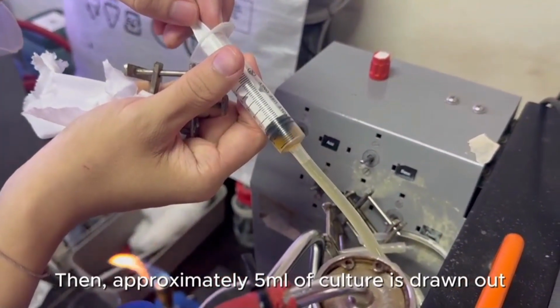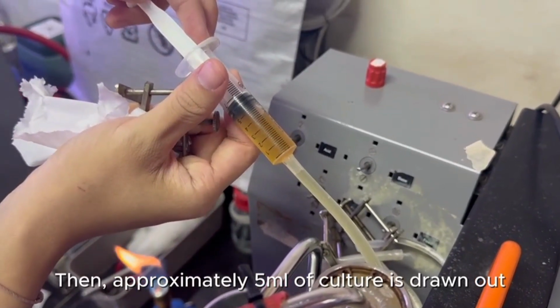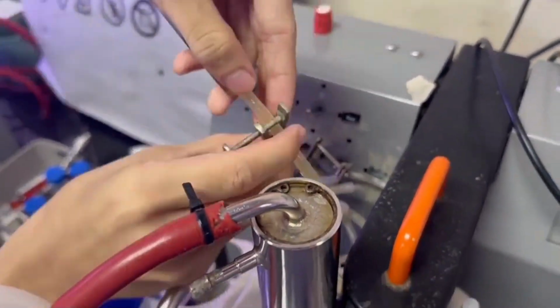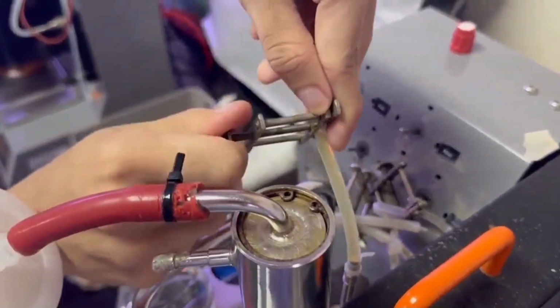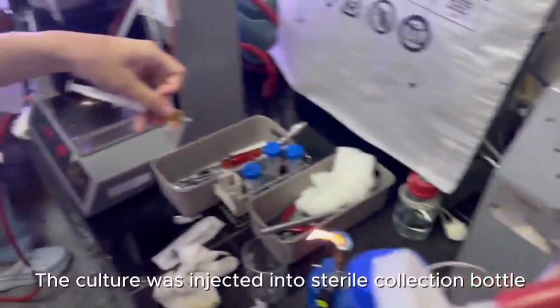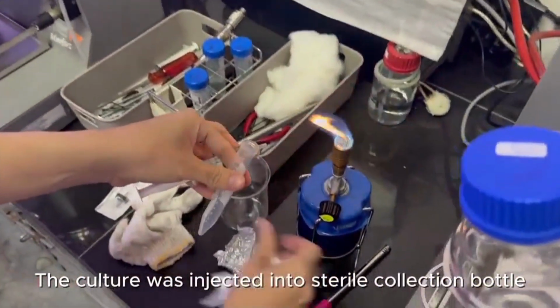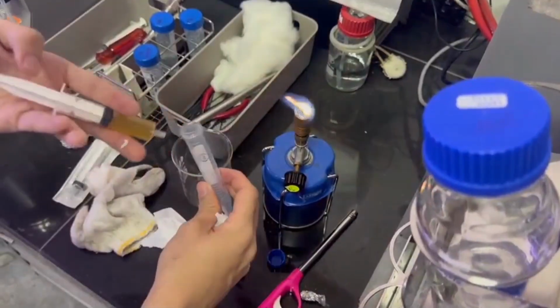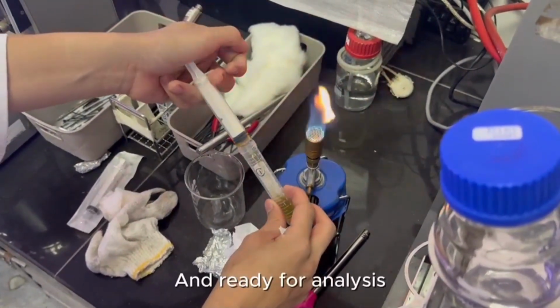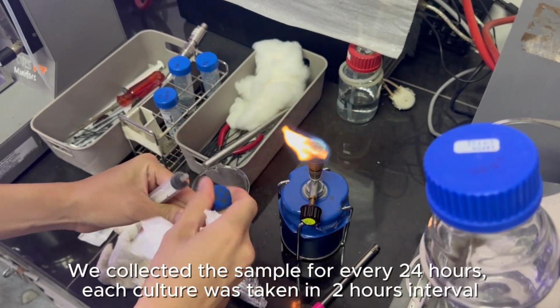Then approximately 5 ml of culture was drawn out. The culture was injected into a sterile collection bottle and made ready for analysis. We collected the samples every 24 hours. Each culture was taken at 2-hour intervals.